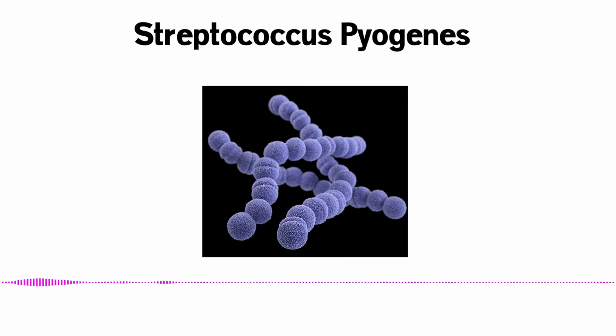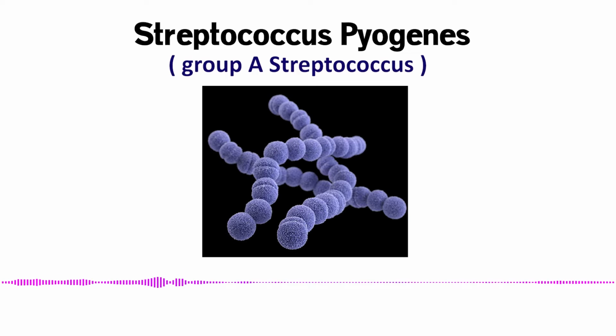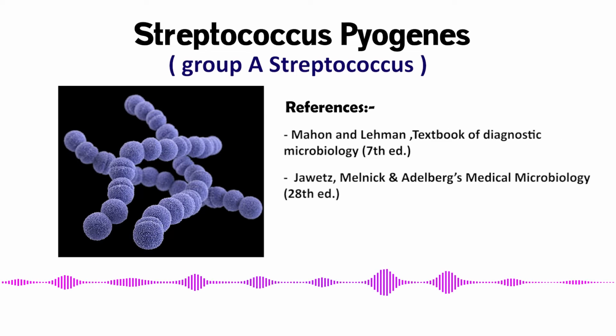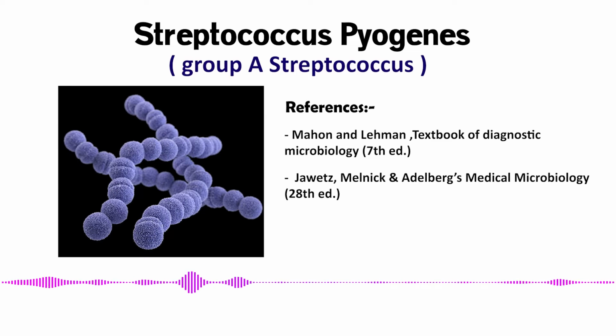Streptococcus pyogenes, often called Group A strep. Right. A really common and important pathogen. So we're doing a deep dive, pulling information straight from the key microbiology textbooks. We're focusing specifically on colony morphology, basically, what S. pyogenes looks like. And our mission really is to boil it down for you, to extract the most critical visual clues from these reliable sources. Think of it as a shortcut. Getting you clued up on this fundamental lab skill fast. It's essential knowledge, really. Turning that textbook description into something you can actually see on the bench.